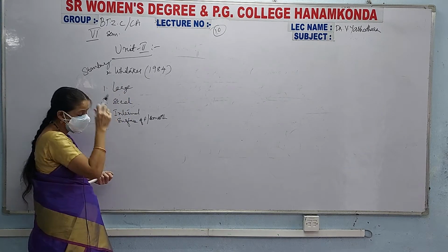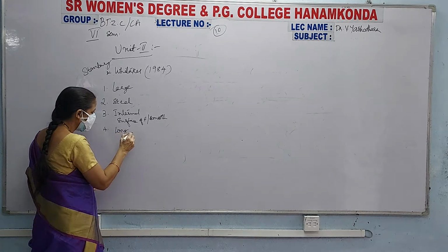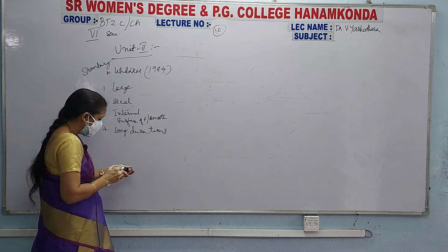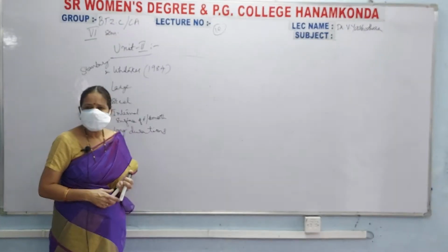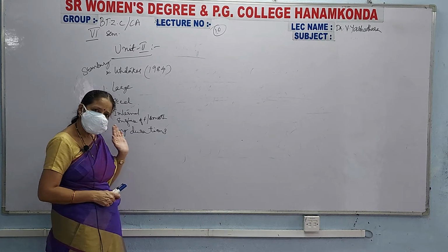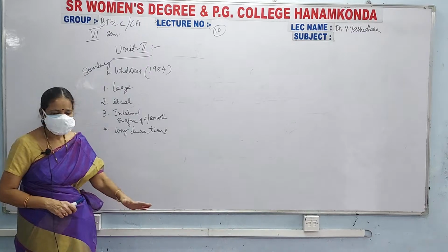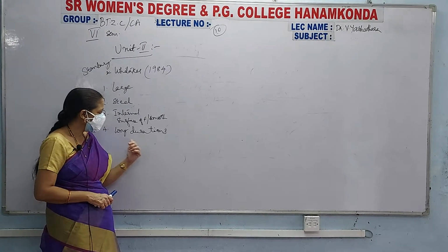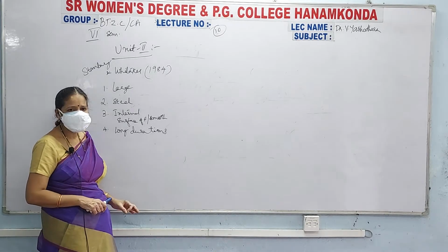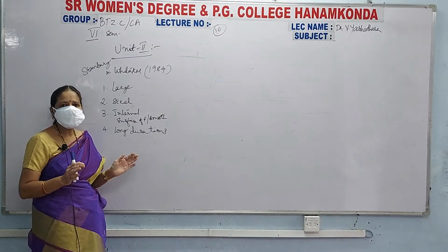Fourth one is it should be able to work for long durations. అంటే ఏంటి, 10 రోజులు 20 రోజులైనా కంటిన్యూస్గా ఫెర్మెంటేషన్ యూనిట్ ఆగకుండా ఏకధాటిగా నడుస్తూ ఉండాలి, అది అసలు ఆగకూడదు. That is known as for long durations it has to work continuously; the fermentation vessel or bioreactor should work continuously for longer durations.